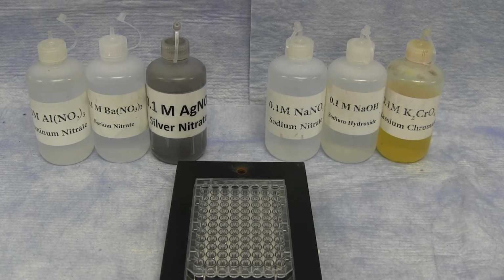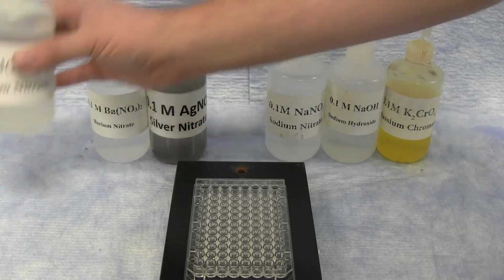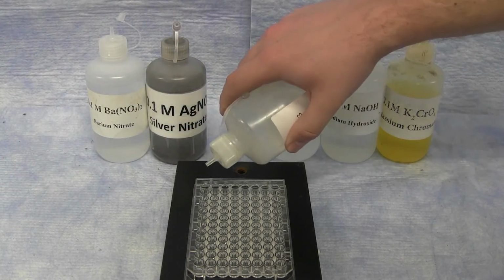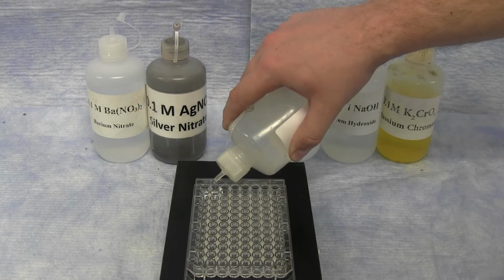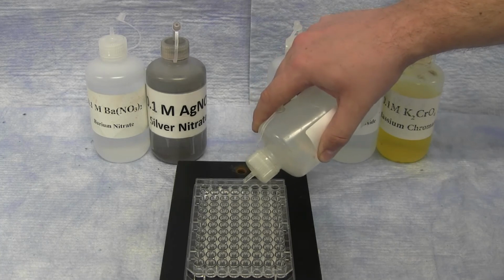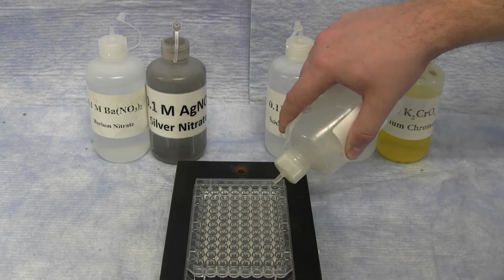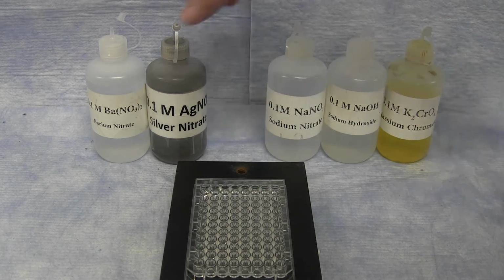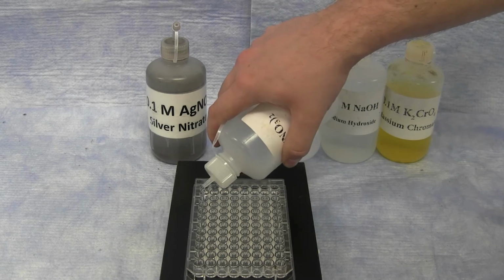So what you'll end up doing is taking one of the metal nitrate solutions and adding 2 or 3 drops in each of the wells going all the way across the 96 well plate. You'll do this for all of your different metal ion solutions.